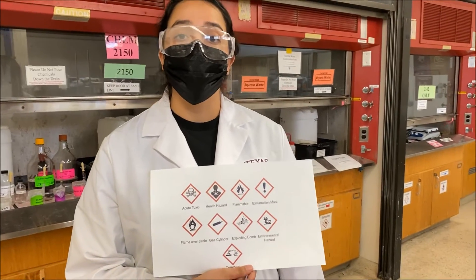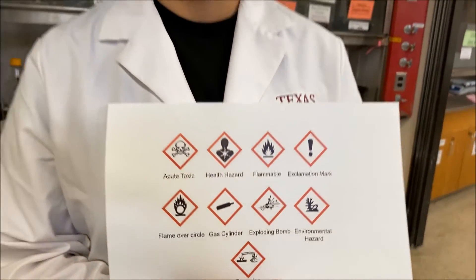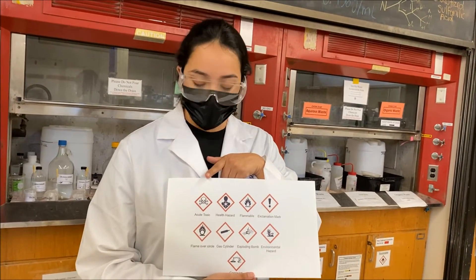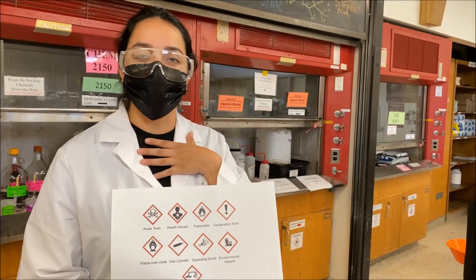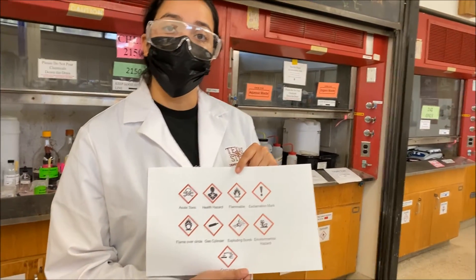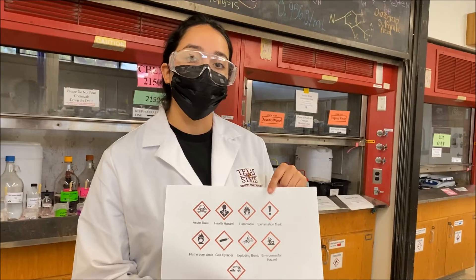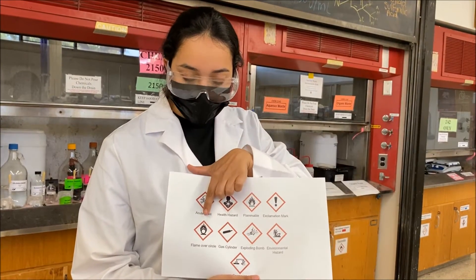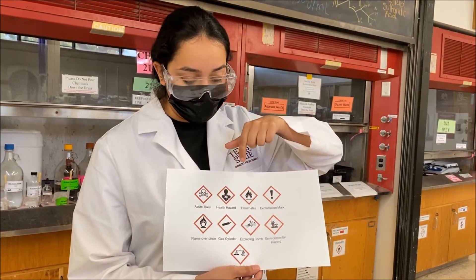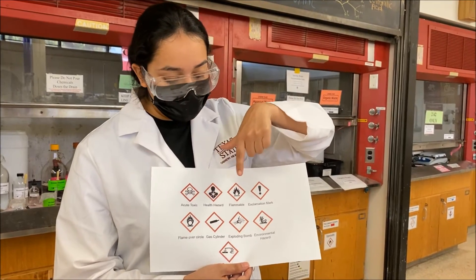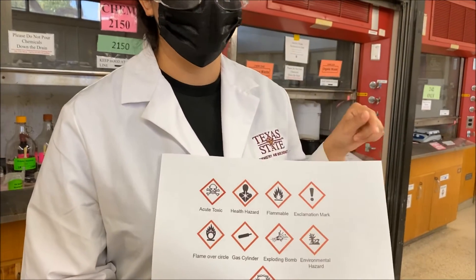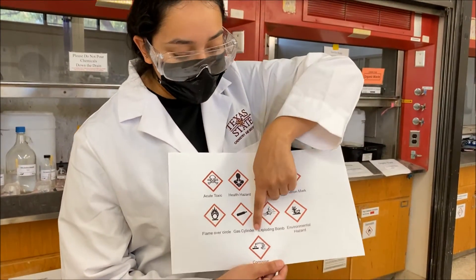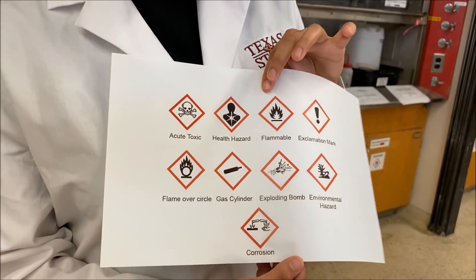These are the specific hazard pictograms you can find on chemicals. If you want to learn more, you can go to OSHA.gov. The skull and crossbones indicates acute toxicity. The person with a burst on their chest is a health hazard. A flame indicates a flammability hazard. An exclamation mark is a non-specific hazard requiring you to read the chemical directions. The circle with a flame on top is an oxidation hazard. A gas cylinder indicates pressure. An exploding bomb is an explosive hazard. The dead tree and fish symbol is an environmental or marine hazard. And the hand with a chemical is a corrosion hazard.